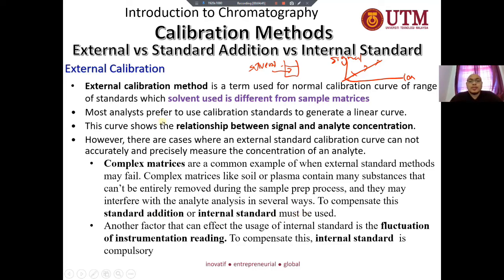So we can use the external calibration when the matrix is not that complex. It means a matrix such as tap water or river water that is not so cloudy, not so contaminated, for example.